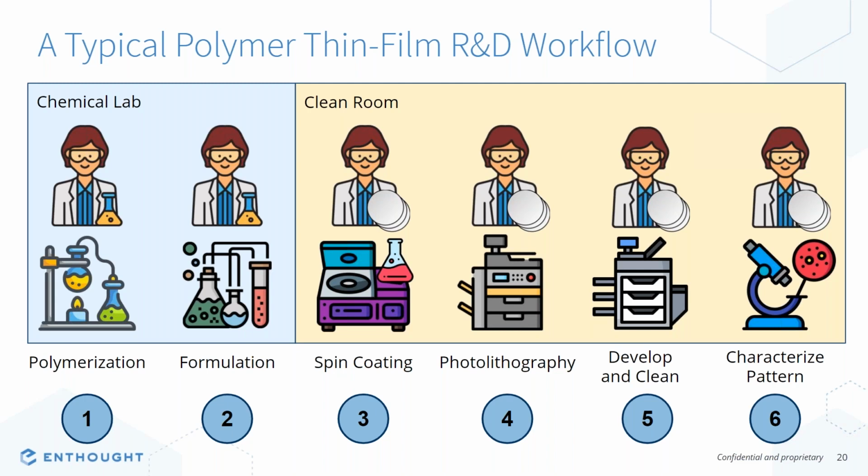So here we have a lab where you start out at the very beginning of this process, where polymers are being synthesized in the synthetic lab by chemists. They're then being formulated by adding additives, solvent, etc., to create a formulation. These formulations are then taken into a clean room for further processing, where they're potentially spin coated into thin films, then patterned using the photolithography process and ultimately characterized, for example, looking at imaging to characterize the resulting pattern.